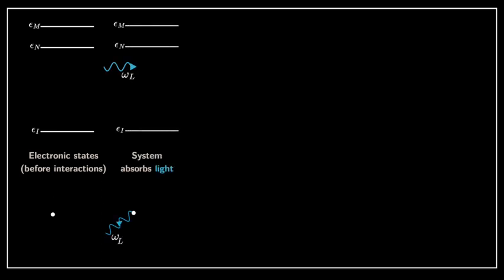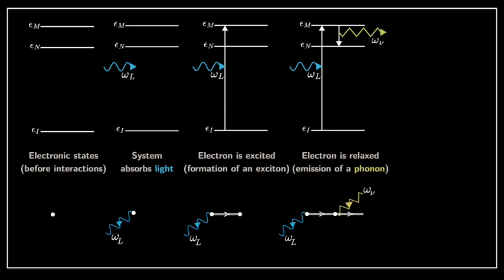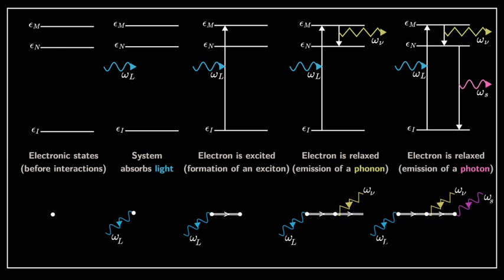This incoming light has an interaction with an exciton. Right here, the exciton is represented by the double line. This is the interaction. This system relaxes and emits a phonon, in yellow. And then of course you still have the exciton between epsilon and epsilon I. And at the end of the day, you have yet another emission, omega s. So you were probably not expecting to understand the Feynman diagram by following this screencast, but here we go.